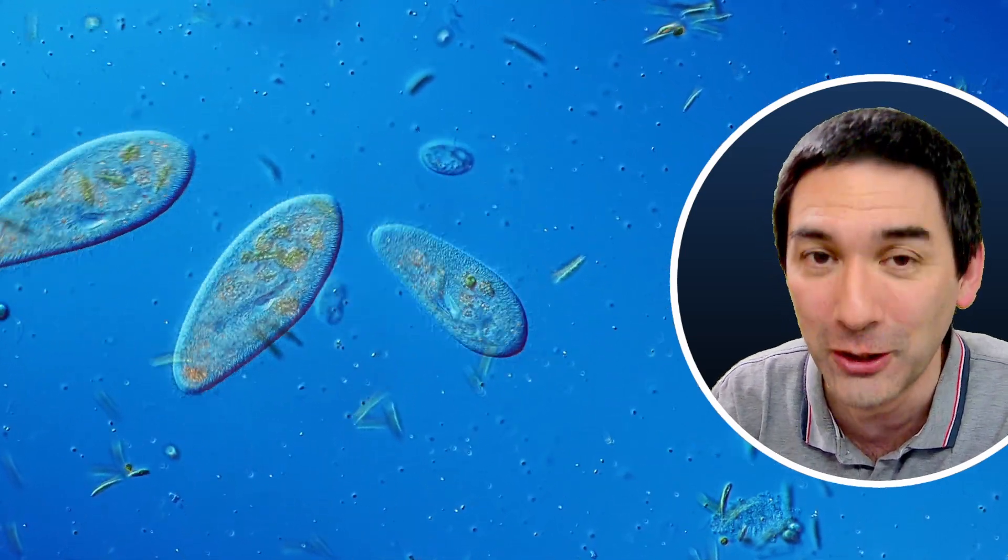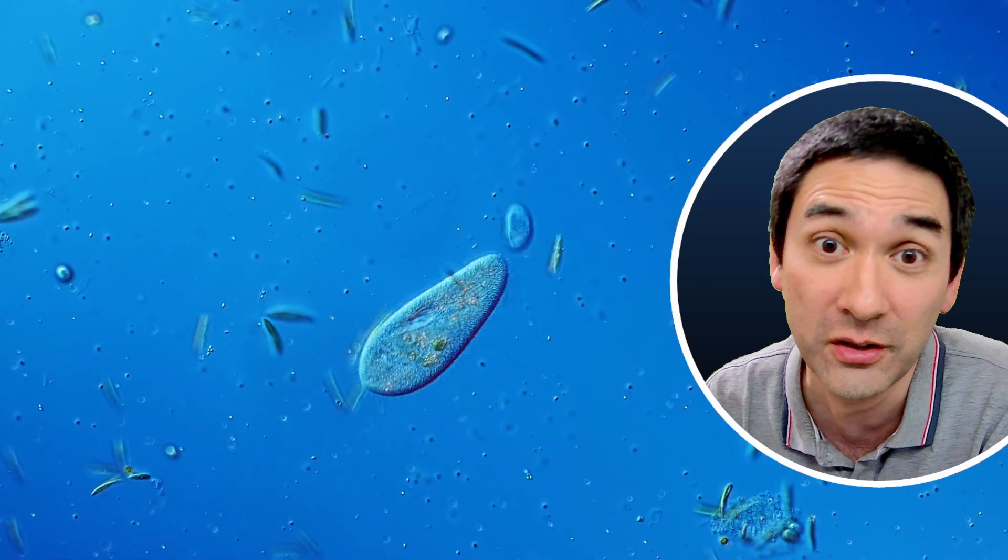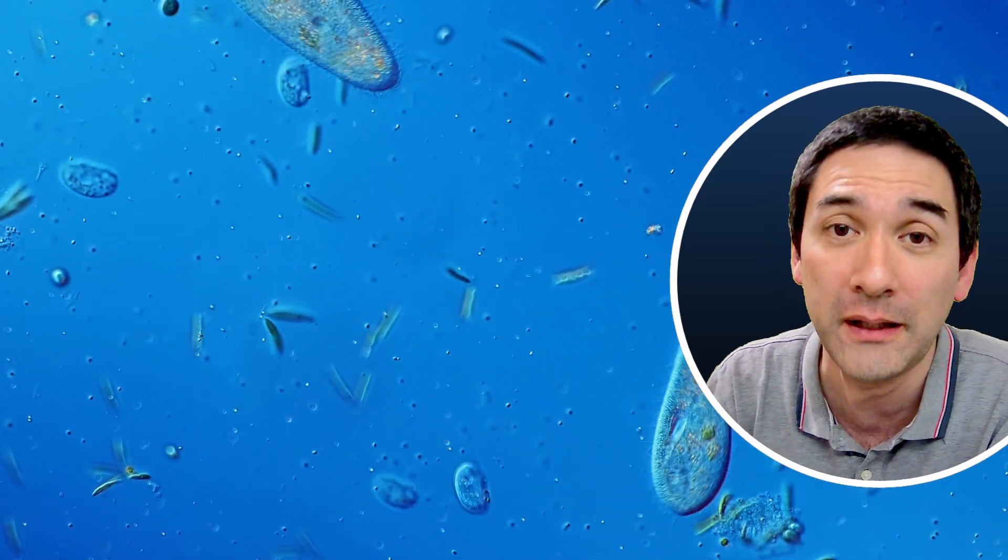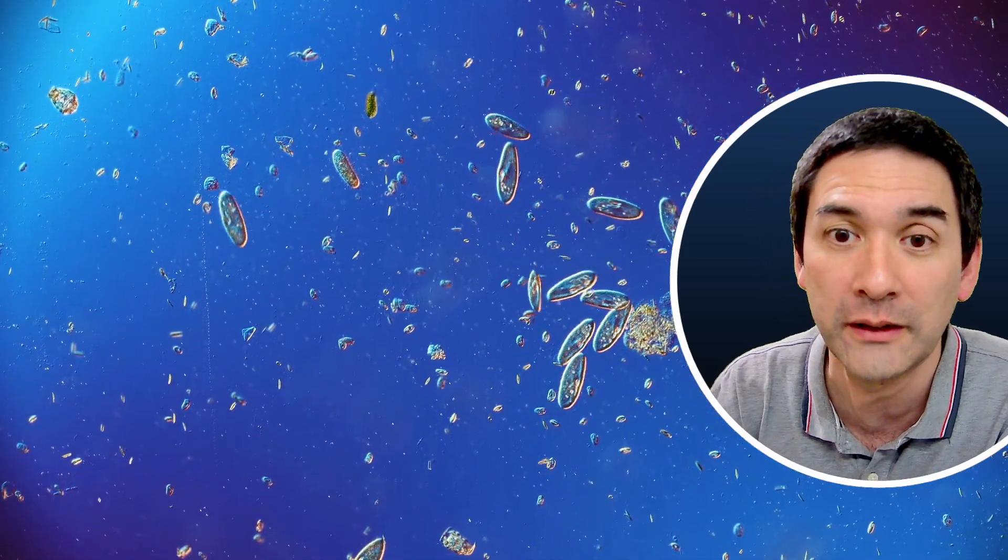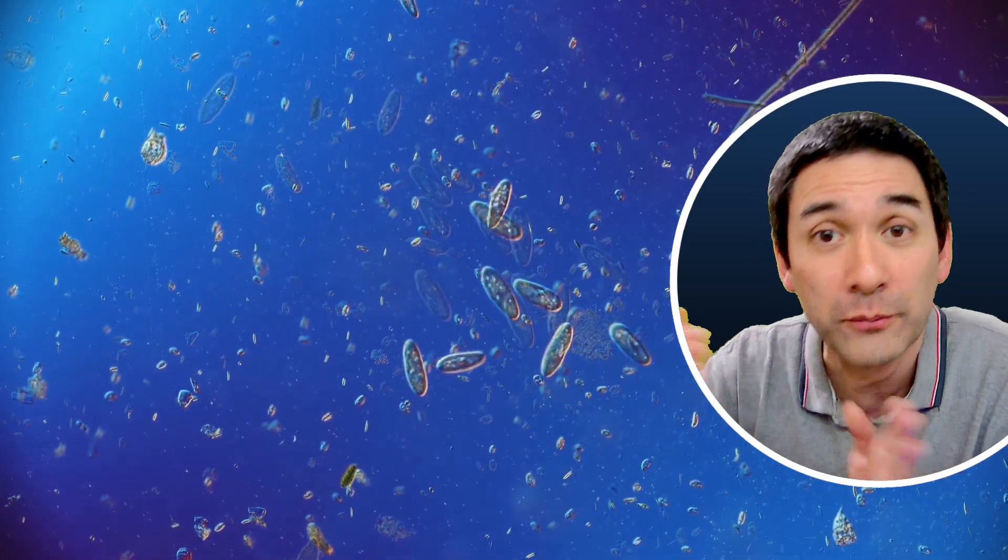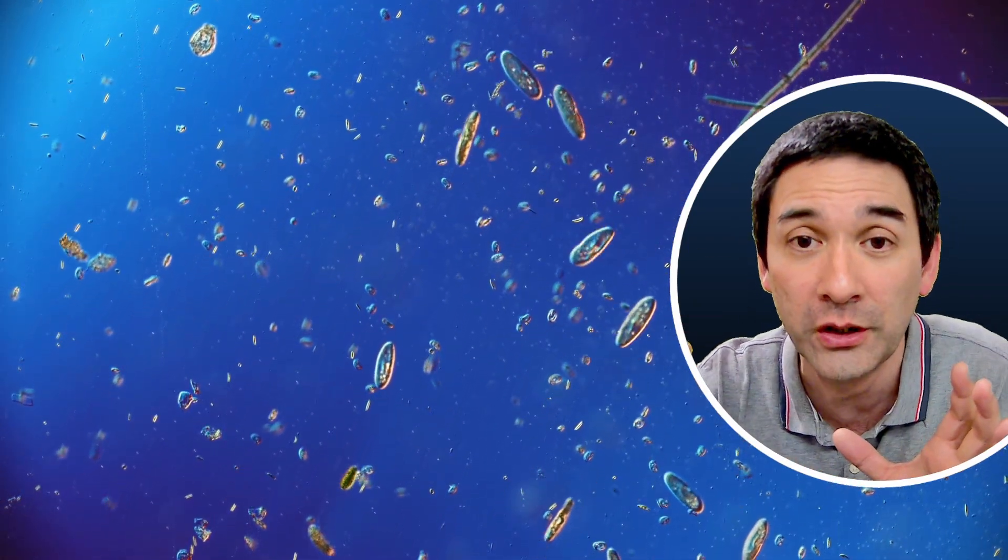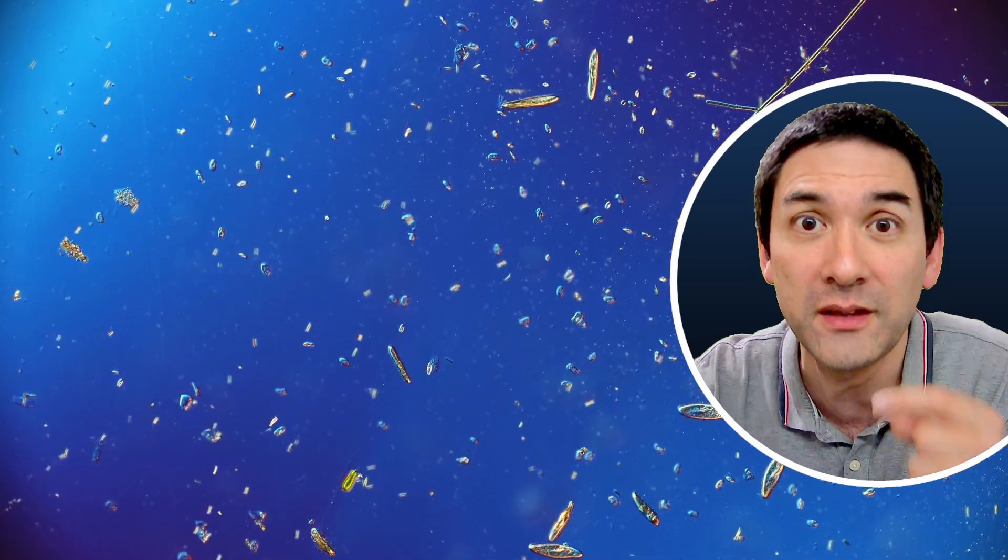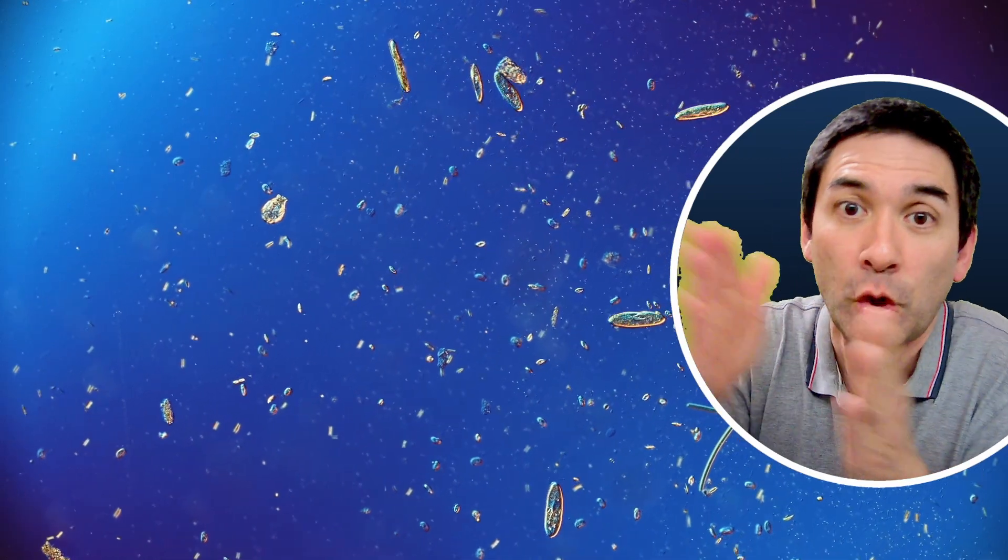But I added some salt here as well. And I observed what they're actually doing. Here they're still moving around more or less happily. They're looking for food and reproducing. And here I already added a little bit of salt and they don't like it. They started to move away from the salt. But sooner or later, they're surrounded by the salt water. And then look what happens. Look carefully. They start to become thinner and thinner and thinner because they lose water as well. And this kind of causes them to collapse and then they die.